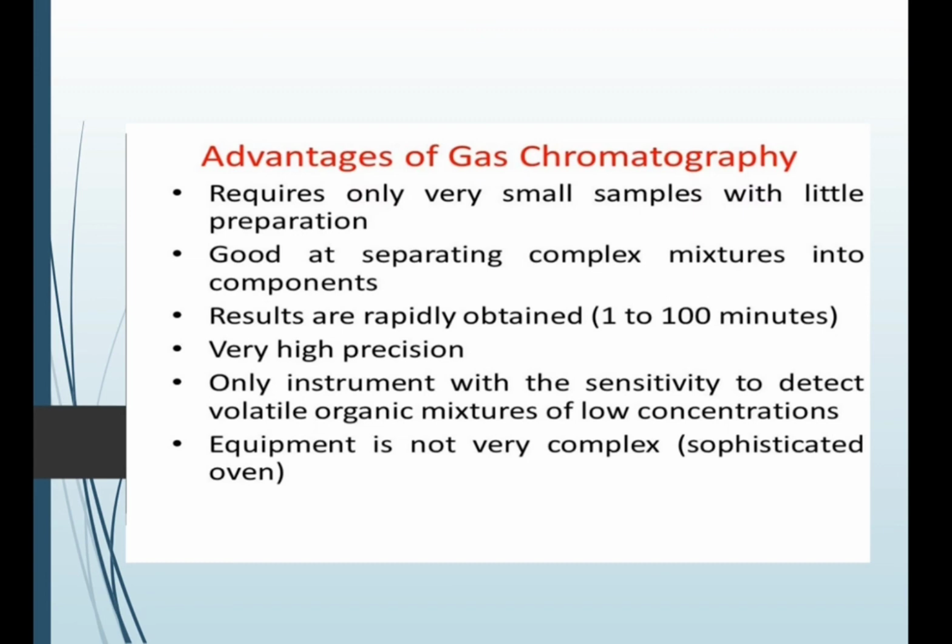Gas chromatography is the technique in which we can separate out the compounds according to their boiling points. The gas chromatography technique is applicable only for volatile gases or volatile components.